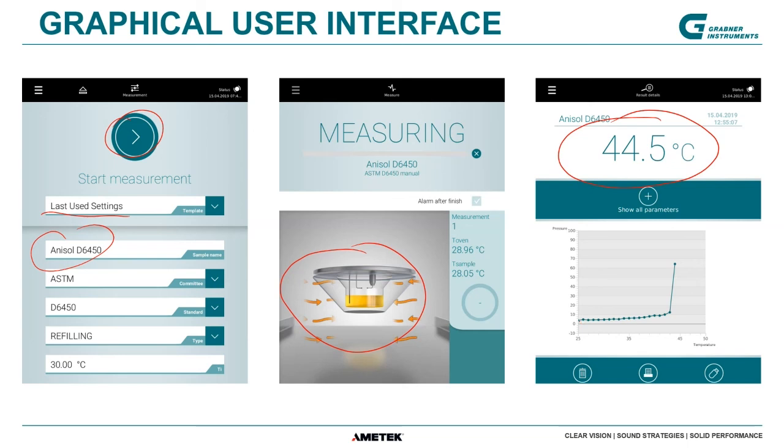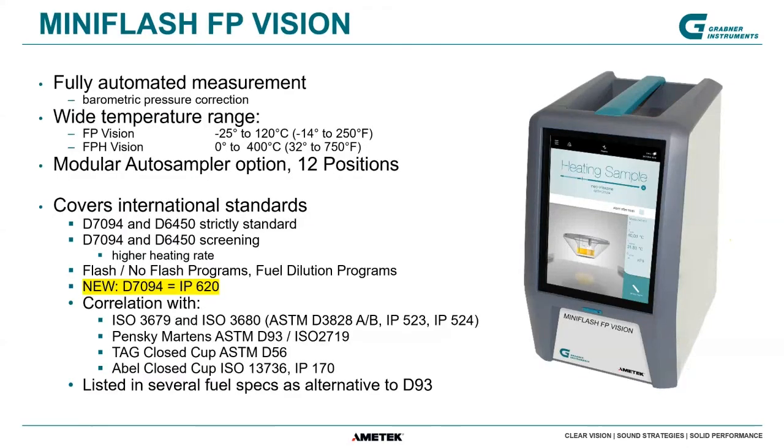This graphic shows you actually the flash pressure. And as I mentioned, when the flashpoint occurs, we are checking the pressure, and the pressure is much higher. And this is basically how this system is detecting the flashpoint. A very unbiased way of checking it.